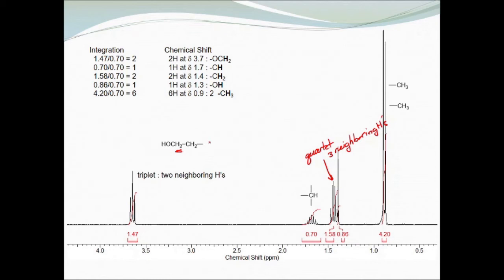So we would expect to have a CH1 on this side. Question then is, do we have a CH1? And yes, we do. So this could be bonded to that CH. In fact, it is the only CH that we have here. And so now we get to this fragment. So far everything makes sense. Triplet bonded to 2 neighbors. We've got our 2. Quartet bonded to 3 neighbors, and we have 2, 3. So far so good.